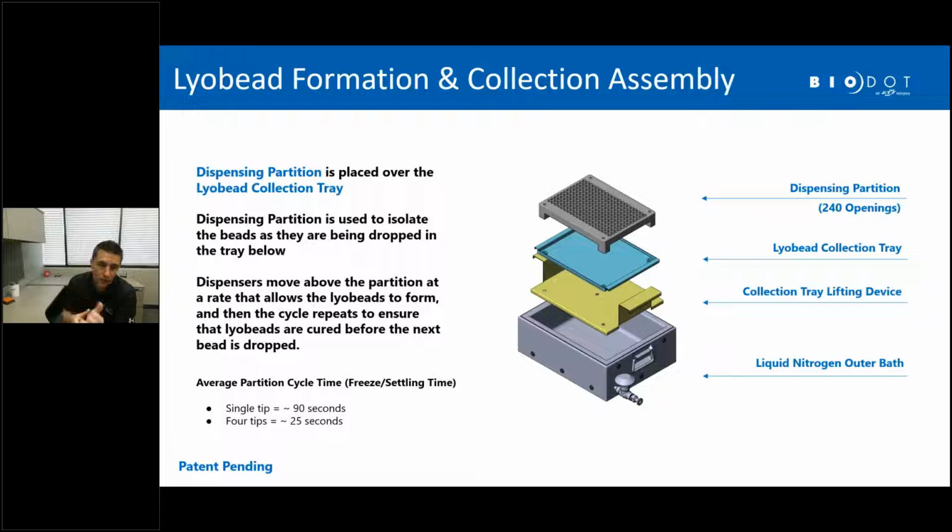We spend a lot of time talking to our customers about the size of the bead and the freeze time. Typically, as the bead reduces in size, the freeze time reduces. For our customers working in the 2 to 4 microliter range, the freeze times are in the 30-second range. As you grow in size, you tend to grow that freeze time, and therefore that has to be considered.